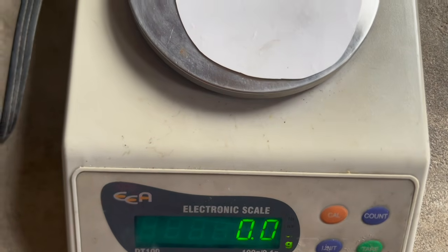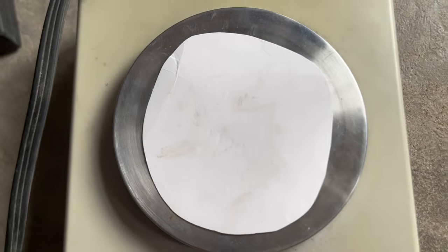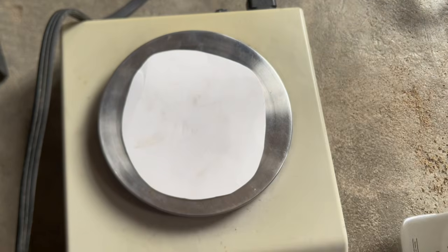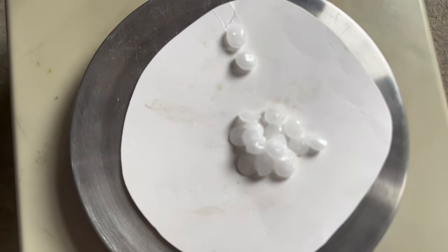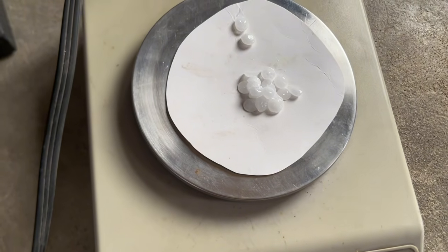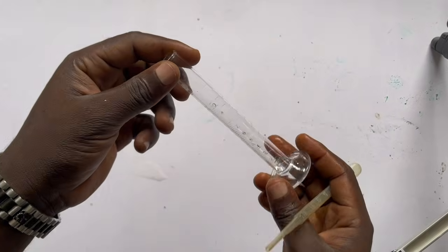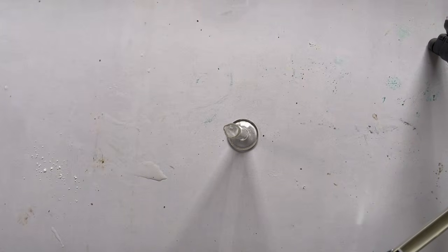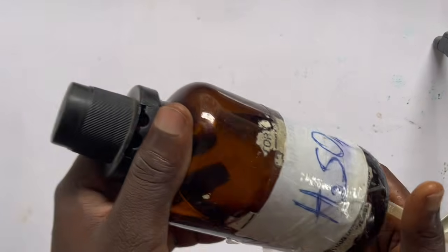So what this simply means is that we are to measure 2.7 cm cube of concentrated tetraoxosulfate 6 acid and dissolve it in 1000 ml of water, while the B simply means that we are going to measure 4.0 gram of sodium hydroxide and dissolve it in 1000 ml. Okay, and remember 1000 ml is equal to 1 dm cube. Now let us proceed.